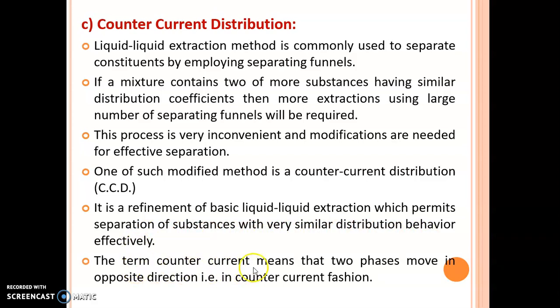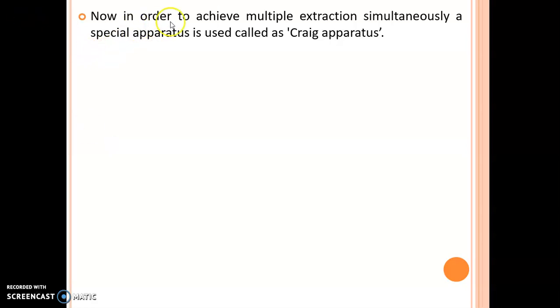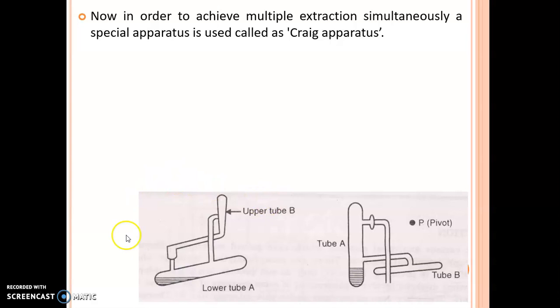The term countercurrent means that two phases move in opposite directions, that is, in a countercurrent fashion. In order to achieve multiple extractions simultaneously, a special apparatus is used, which is known as the Craig apparatus. So this is the Craig apparatus.